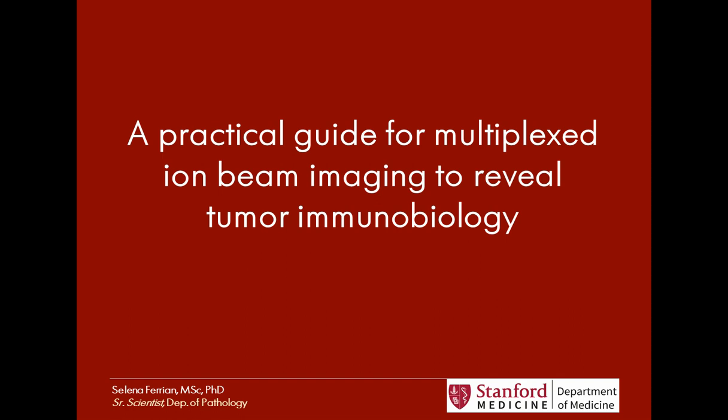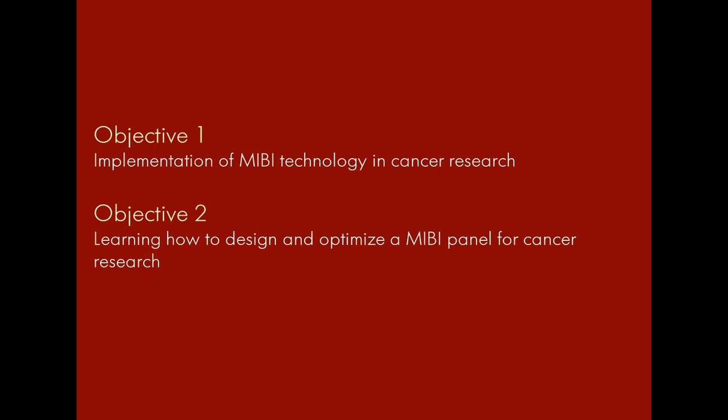Today, I will give you a brief overview on how to reveal the tumor immunobiology using an imaging technology called multiplex ion beam imaging by time of flight, or MIBI. The first aim of our webinar is focused on how the MIBI is used in cancer research, where I will show you how this imaging technology is applicable to a variety of healthy and neoplastic tissue and what is the outcome that we will be able to achieve.